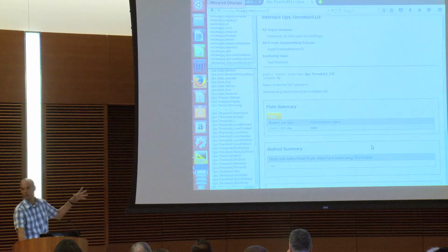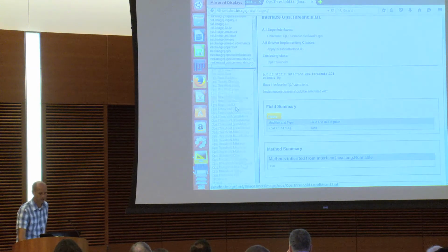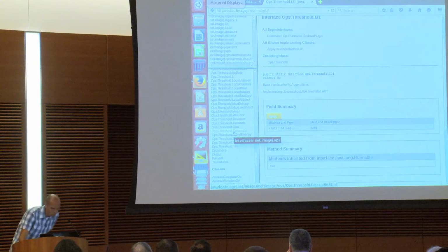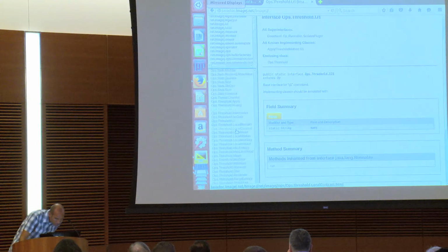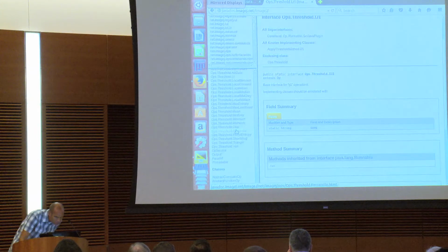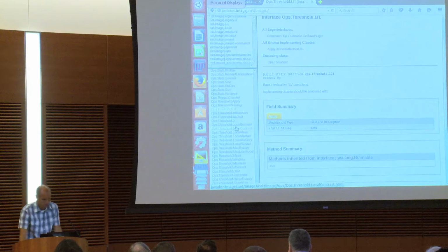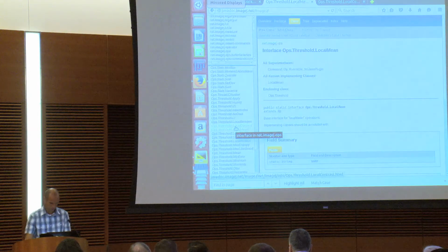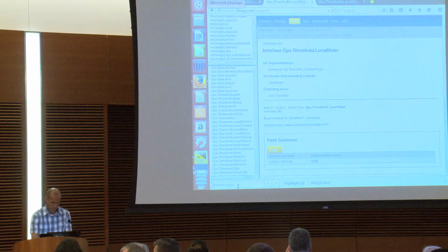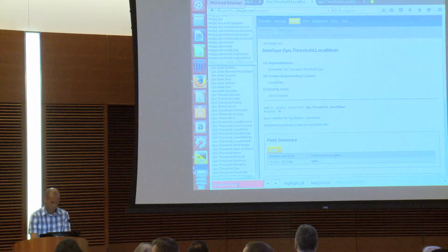So these are the actual interfaces. This gives you a good idea of what's available. I'm looking for the threshold namespace. By the way, if you get really addicted to Javadocs, there's a Chrome extension that adds a search bar to any Javadoc website. It's so nice.